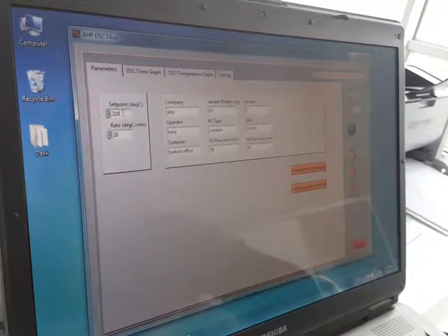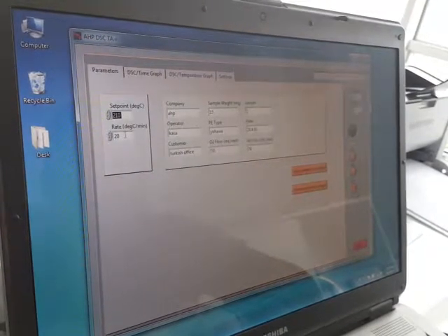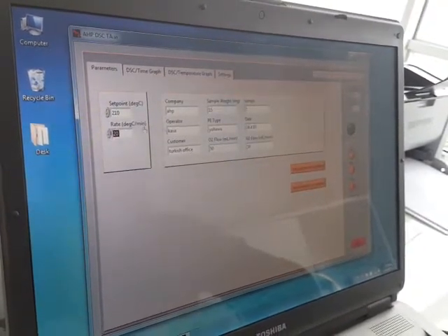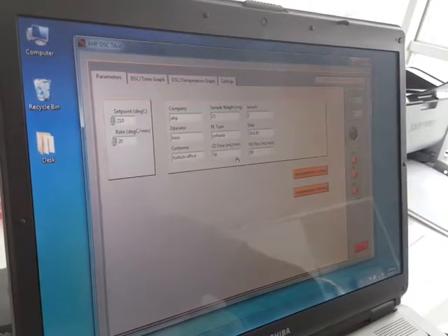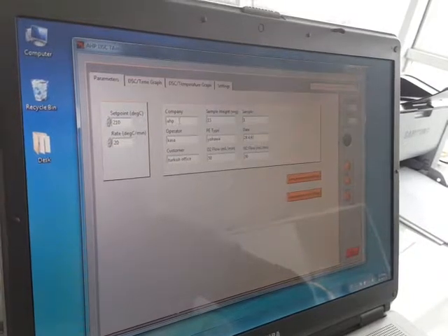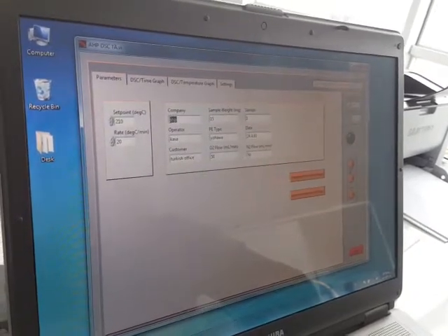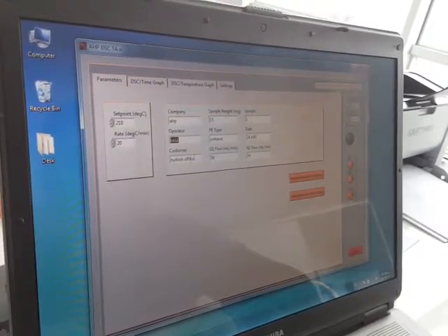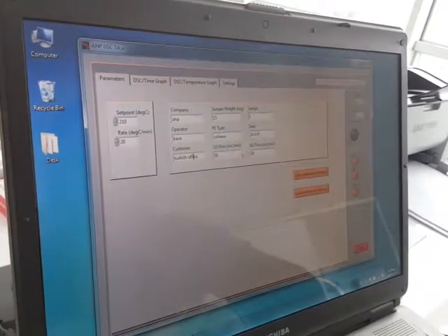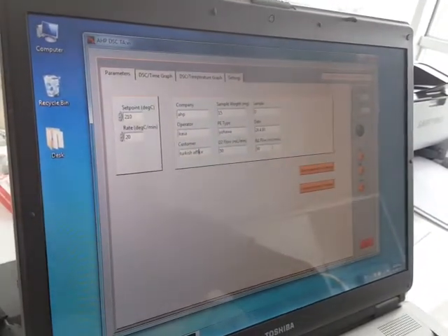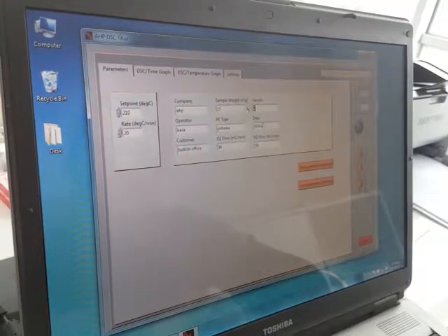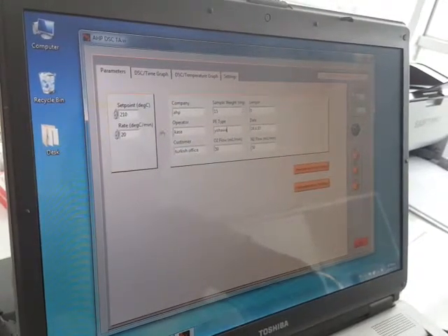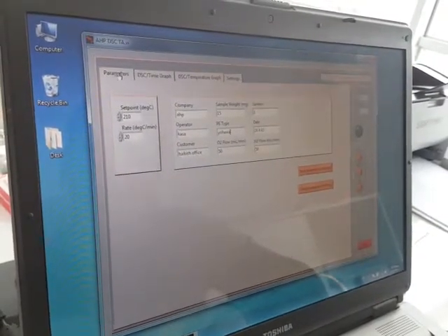At the first page you have the set point temperature, the temperature increase rate, and general information of the sample such as sample weight, company, operator, customer, auto flow and flow, date, time, sample number.